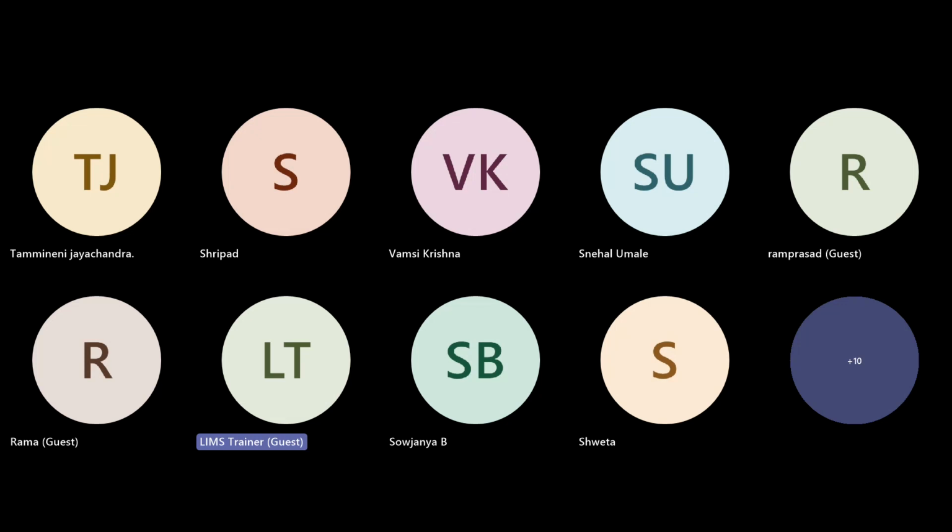Now, LabWare LIMS uses something known as access routine and query tag with this Crystal Report, and with this access routine and query tag, you can generate that report. I can teach you what an access routine is and what a query tag is, because this is a part of LabWare LIMS. But if I go into Crystal Report, that is another 30-hour course. Crystal Report will pull your entire LIMS database, and everything inside Crystal Report is a bit different. That is one separate, big chapter. Okay, got it. Thank you. You're welcome.